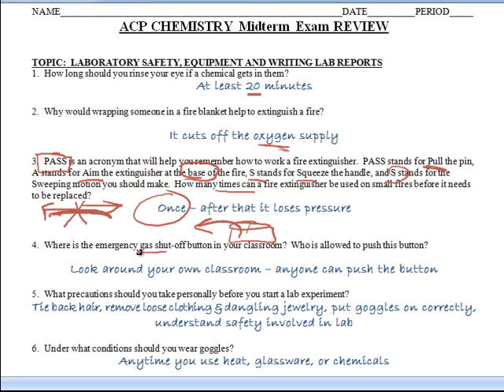Alright, number four. Emergency gas shutoff. Take a look around your own classroom. Obviously, I'm doing this for all the kids in all different classrooms. So look around your classroom. Find it. Who's allowed to push the button? Anyone. Anyone can push that button. Whoever's closest should hit it, and then all the gas shuts off.